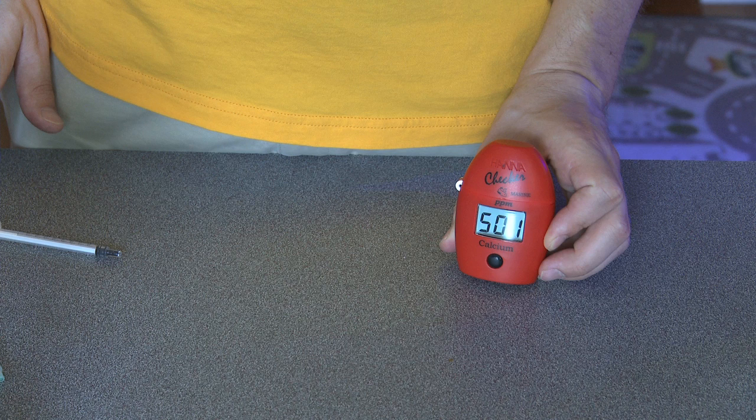Voila! There's your calcium level. Dang it! I need to turn down my dosing pumps!